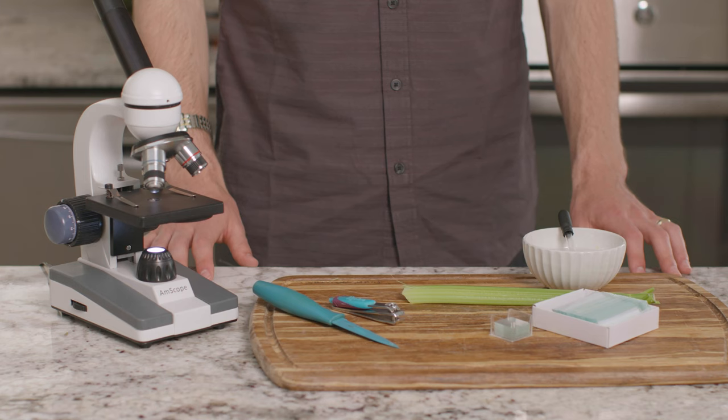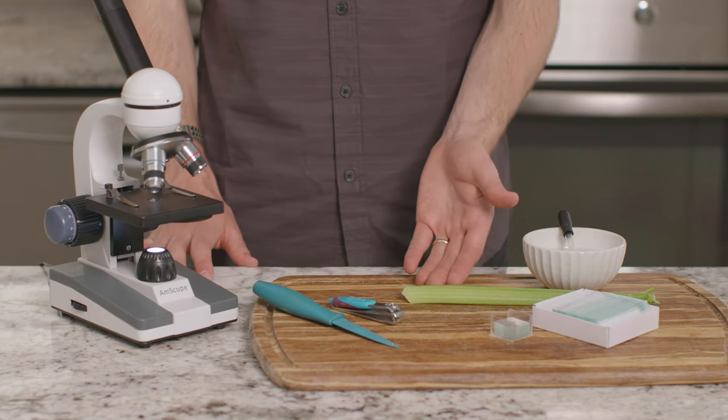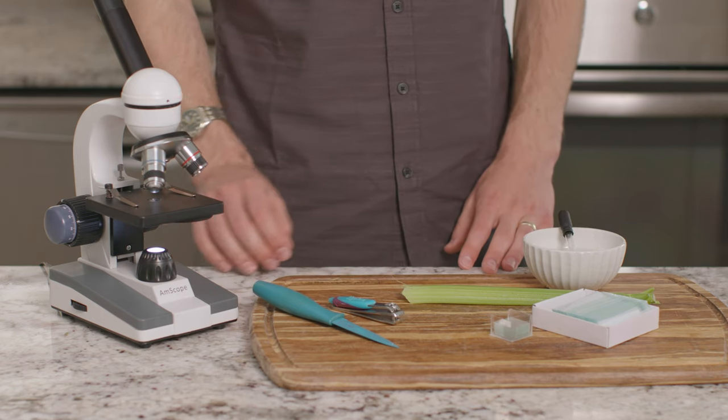Hello, my name is Joseph, and I will be showing you the plant and animal cells experiment from lesson 9 of the botany unit from The Good and the Beautiful. In this experiment, we will be comparing plant and animal cells using celery and a clipping of a human fingernail.